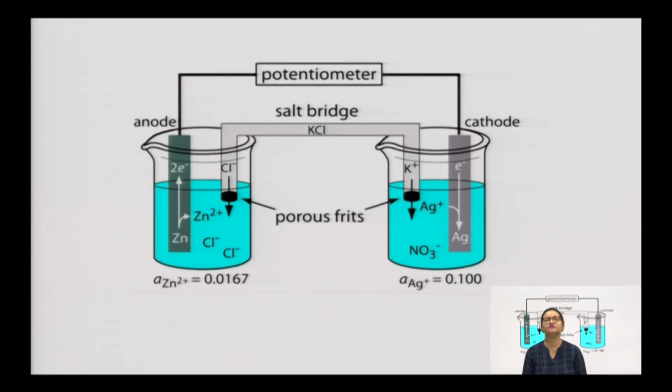This is the diagram which shows a potentiometer easily. Here you can see one electrode is an indicator electrode and one electrode is a reference electrode. One forms a half cell reaction while the other forms the other half cell reaction. We can easily see.